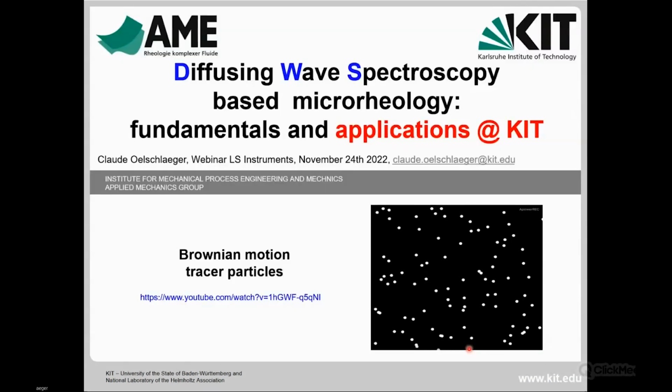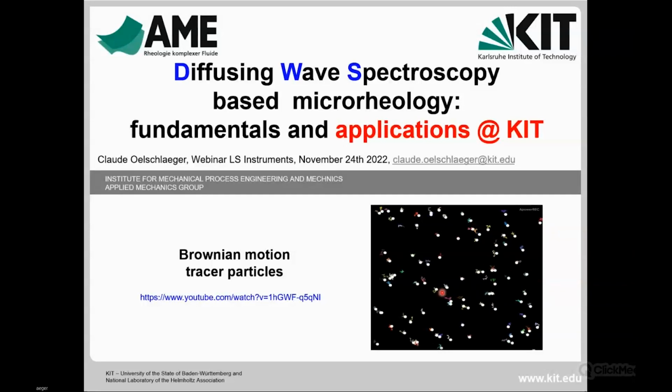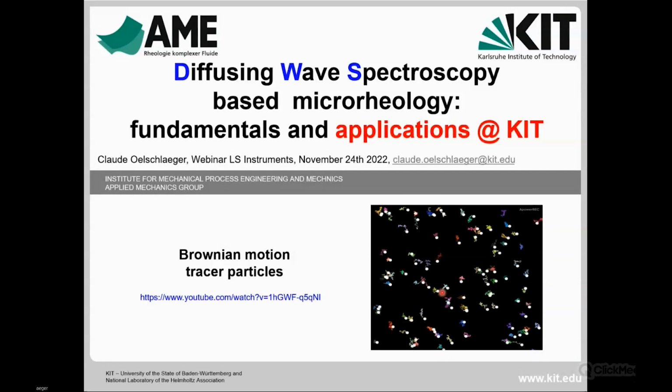But first, I just show you this small video, which shows the displacement, the Brownian motion, of some tracer particles, because this DWS technique is based on the motion of these tracer particles. You will see the principle, for people who are not familiar with this technique.